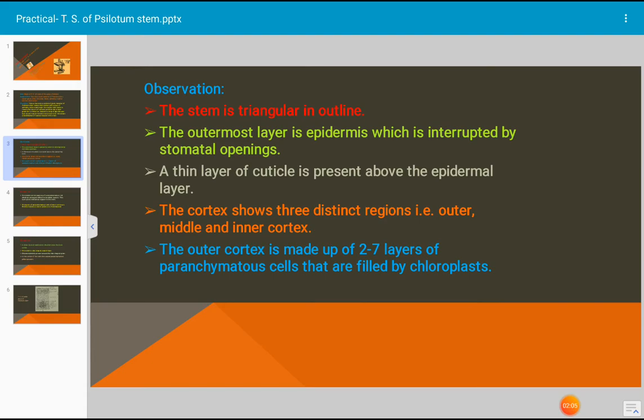A thin layer of cuticle is present above the epidermal layer. The cortex shows three distinct regions. The cortex is placed below the epidermal layer and is divided into three parts: outer cortex, middle cortex, and inner cortex.